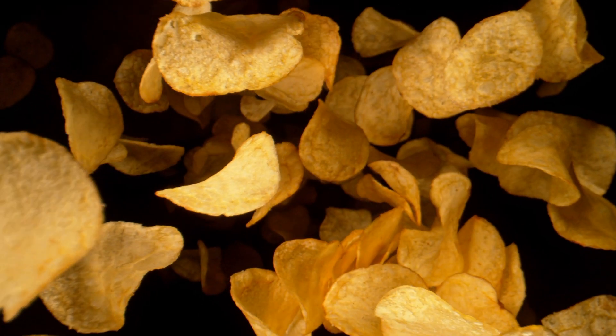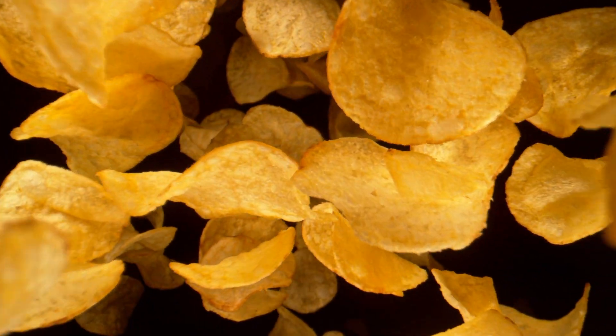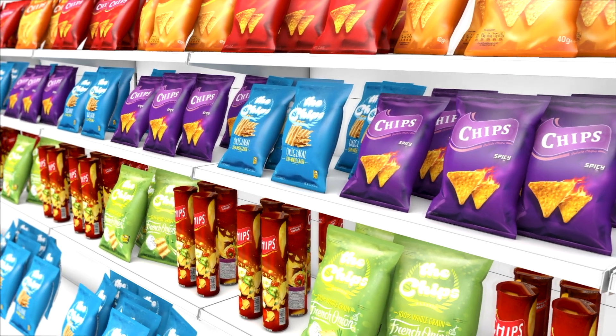Chips, the most popular snack food in the world. Using a number of different main ingredients, with a seemingly endless variety of flavors and fried or baked, chips are made and sold around the globe with one big challenge.